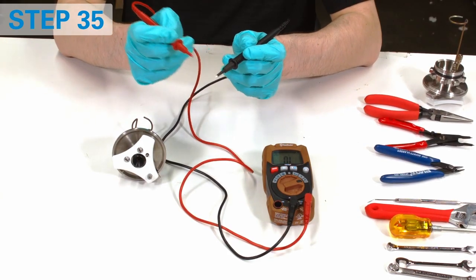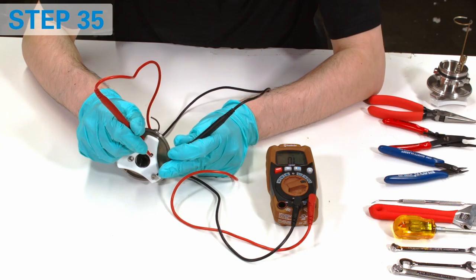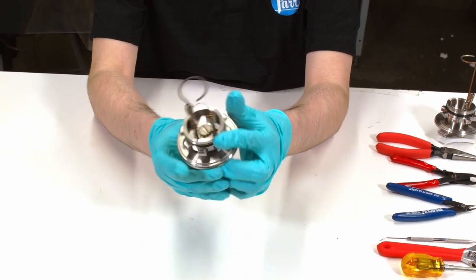Use the multimeter to check the electric connection between the electrodes. The resistance should not exceed a couple of ohms. If it's not the case, the screw holes should be additionally cleaned from the buildup. The head is now complete.